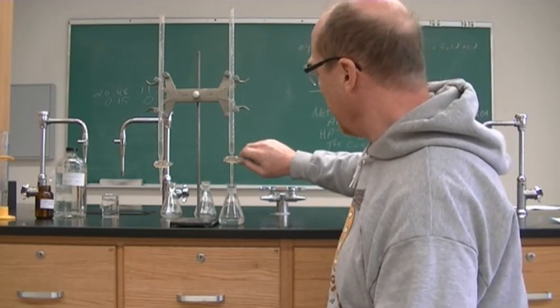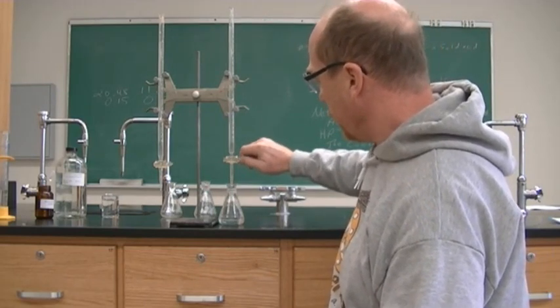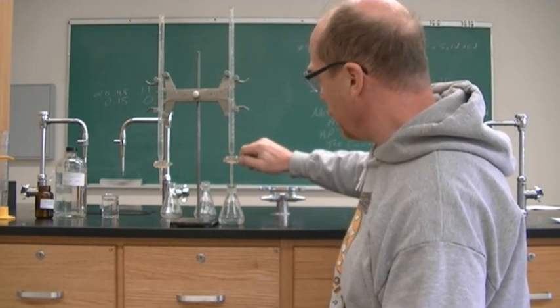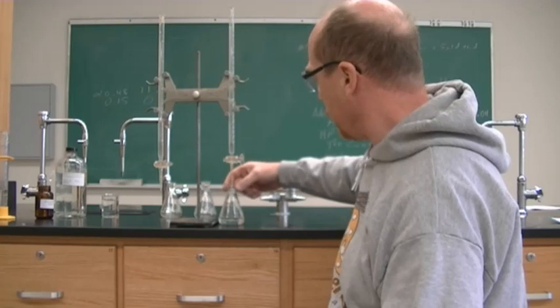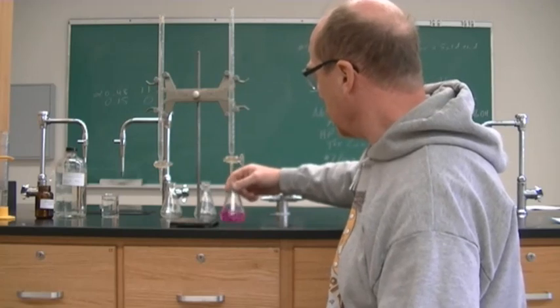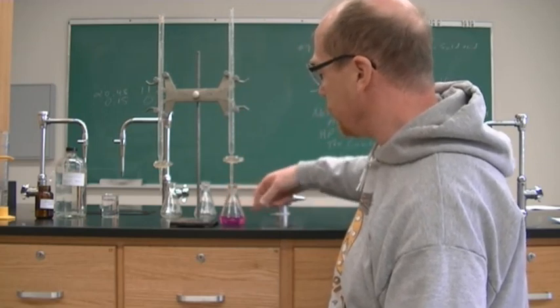All right, so I'm going to add this very slowly. It should turn pink immediately. Deionized water should be neutral. As soon as we add NaOH, it should turn pink. And it does. One drop turned it pink.